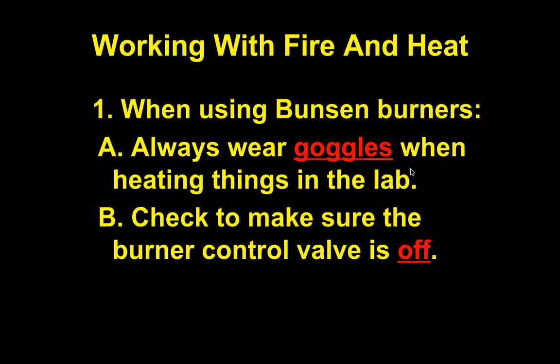Check to make sure the burner control valve is off before you begin. I'll show you a picture of what that looks like coming up.